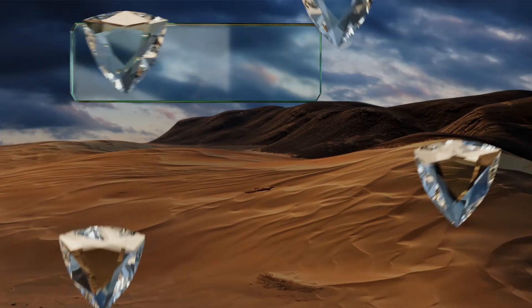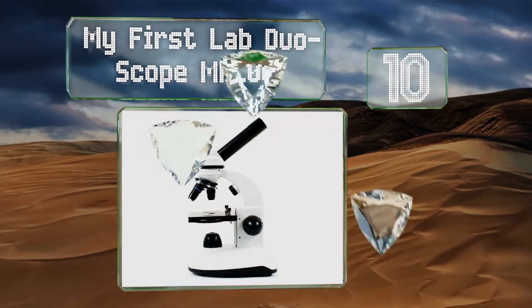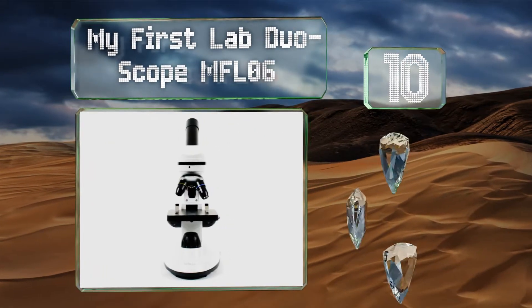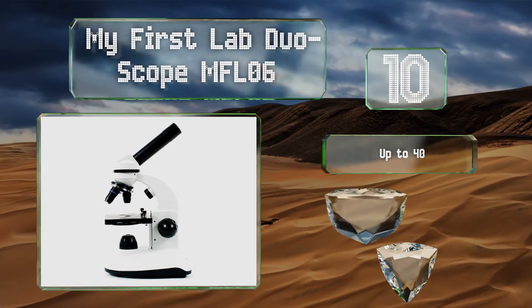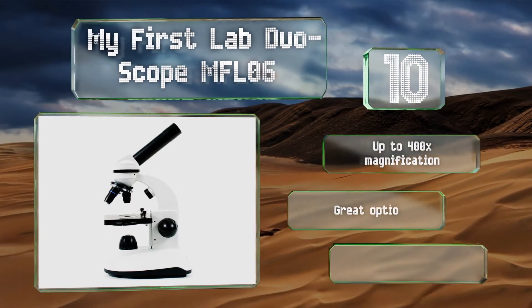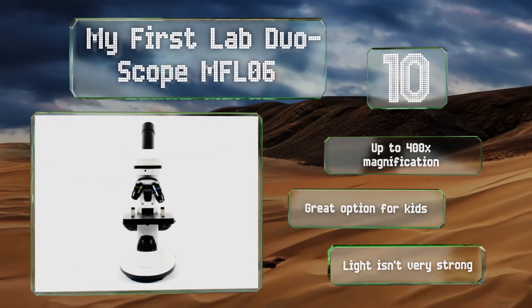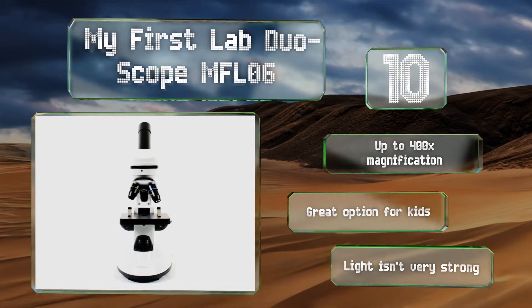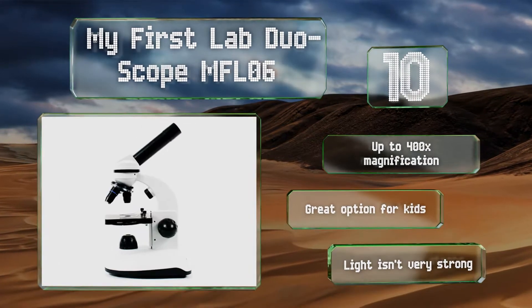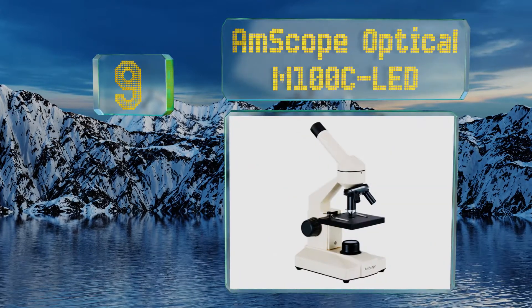Starting off our list at number 10, the My First Lab Duo Scope MFL06 is cheap in terms of price but of surprisingly good quality considering its affordability. It comes with a kit that includes slides, stains, and other implements to let you start exploring immediately. It delivers up to 400 times magnification and is a great option for kids, however the light isn't very strong.